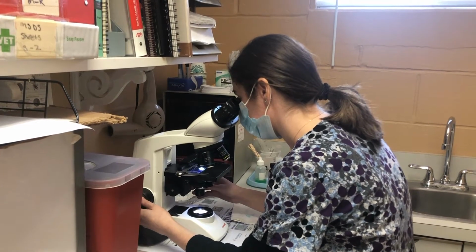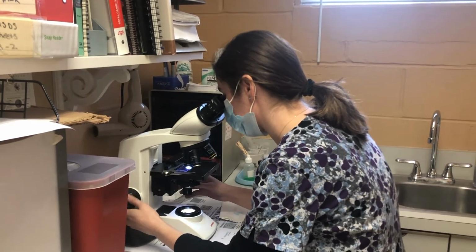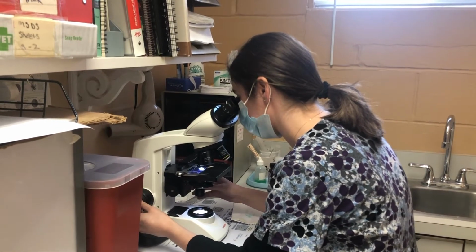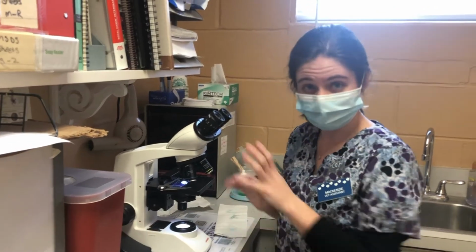And I actually see, right in front of me, an intermediate cell, so that's going to be a little bit bigger than the parabasal cell, and it still has the nucleus. So we can infer, taking all this into account, as well as looking at the clinical signs of the dog, there wasn't any swelling of the vulva, there wasn't any discharge present.